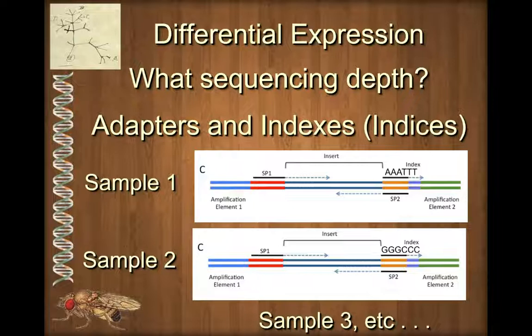And so that's where sequencing depth comes in. At 50x, we might have some areas of the genome that just because of chance are covered more than 100 times. We might have some that are only covered a couple of times. And inevitably, because of that random sampling, we're going to get some small pieces of the genome that maybe never get sampled at all. And to some extent, the law of diminishing returns applies here, because as we put more and more resources in and our samples get larger and larger, the more reads we do, the less chance there is of sampling something new, because we've already covered 99.999% of the genome. So the chance of those final reads being something new is fairly low. We have fairly good coverage for most of the genome, but maybe poor coverage and a few little gaps in some areas.